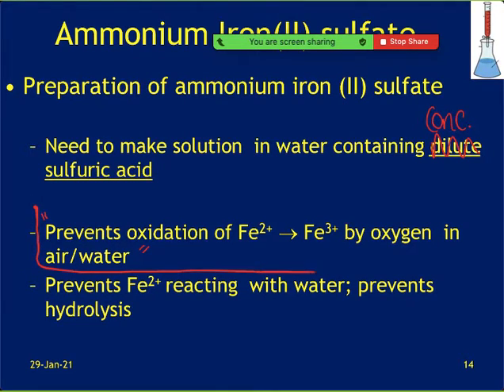So what you wrote in is the KMnO4 blurb for sulfuric acid, and this is the iron blurb for sulfuric acid. So you are protecting the iron. You're making sure that when you do your titration, all you have is Fe2+ in your flask.